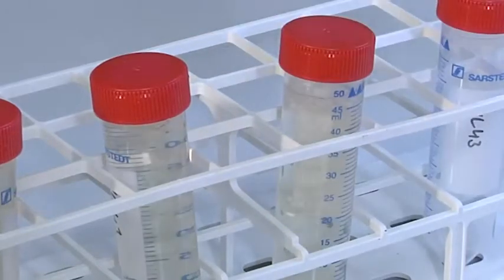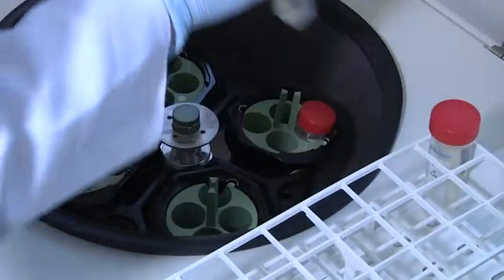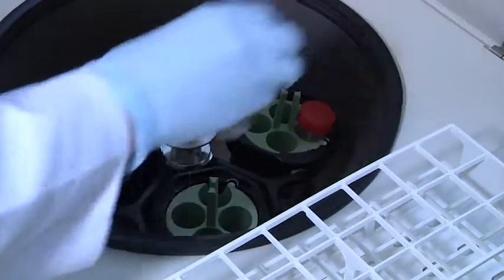After the fungal cells have been cultivated, their proteins are isolated. For this, cells are centrifuged to build a pellet.